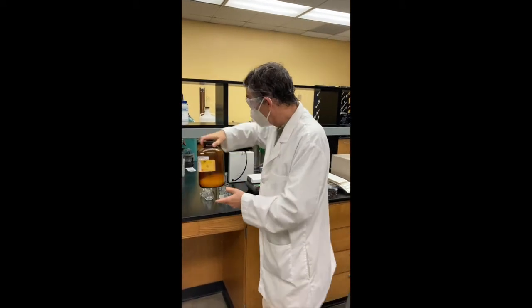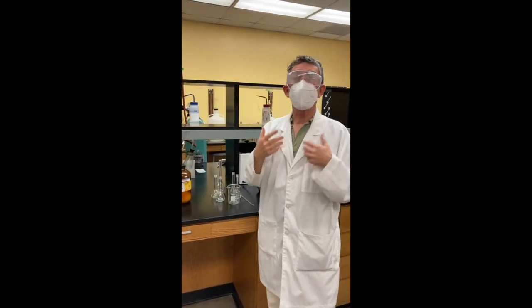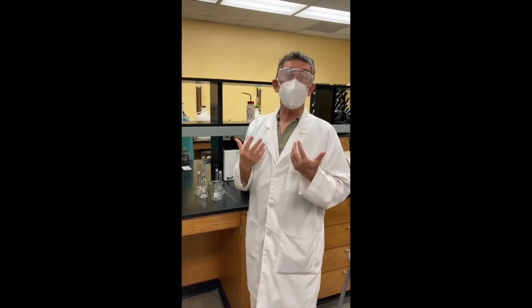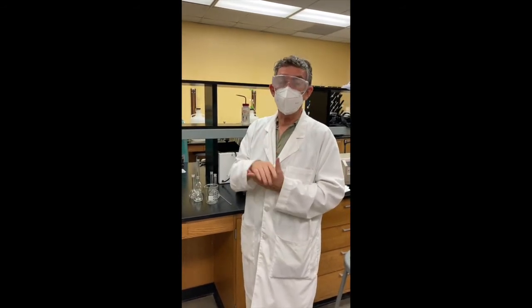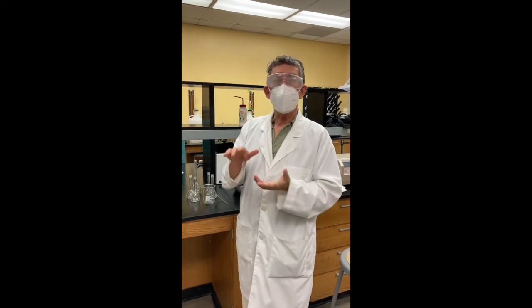So that's our goal. And to do this, the physical property we're going to monitor is called the viscosity. The viscosity is essentially how thick a solution is. If you think of honey, it's very viscous. For example, water's not very viscous. And hexane is less viscous yet.